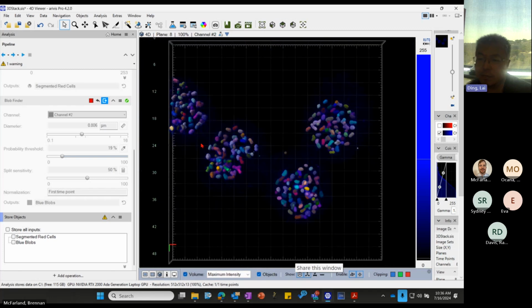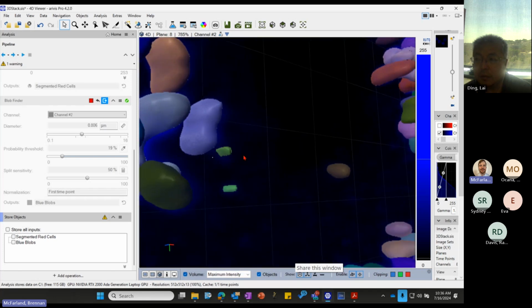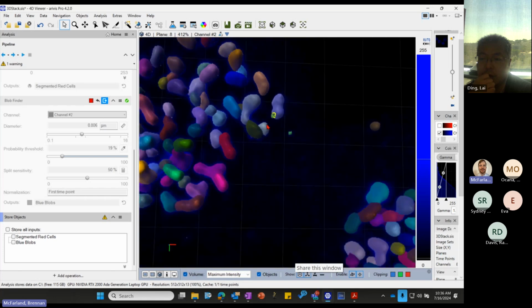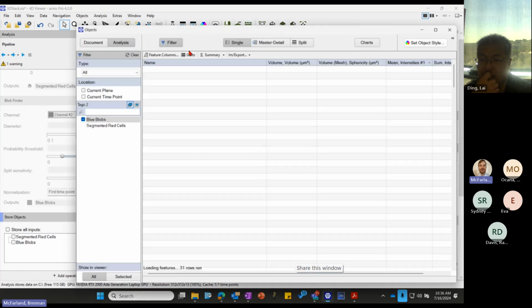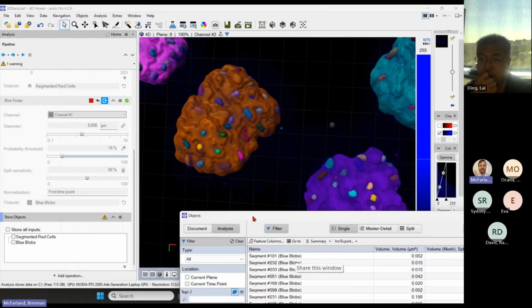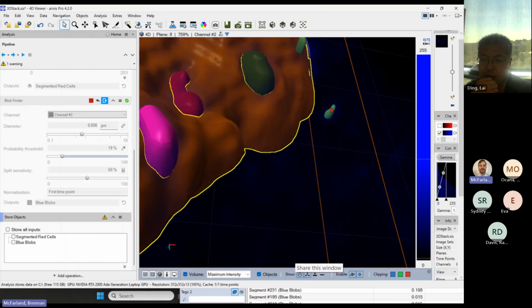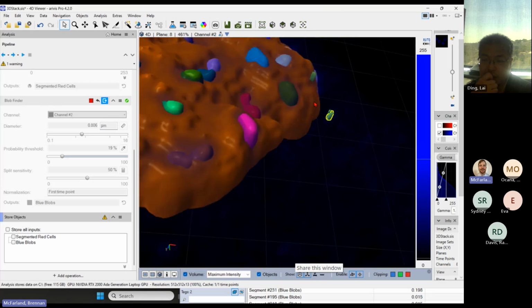Yeah, thanks. And we can do some filtering, either in adjustments of the values, but there are some really tiny blobs that are getting included. Maybe we want them, maybe we don't, but actually, I don't think we would need to because we're going to do colocalization. And if we're looking at colocalization, this is not going to be co-localized with it, right? So it'll kind of fall out anyways.